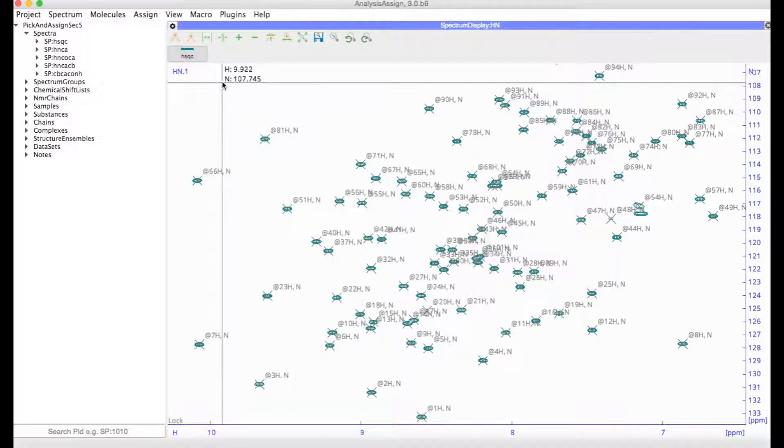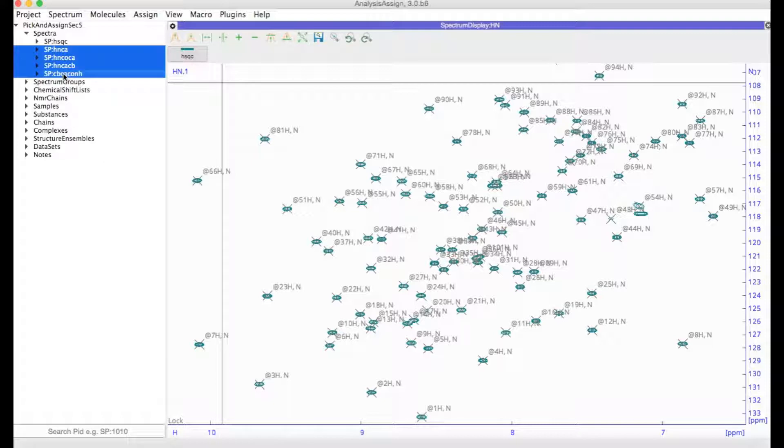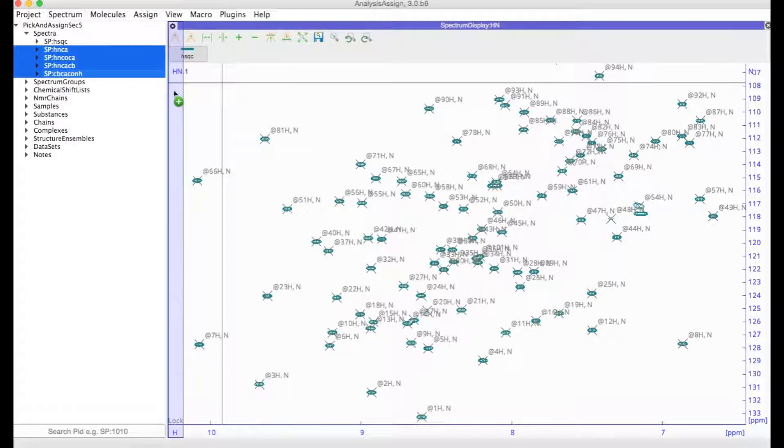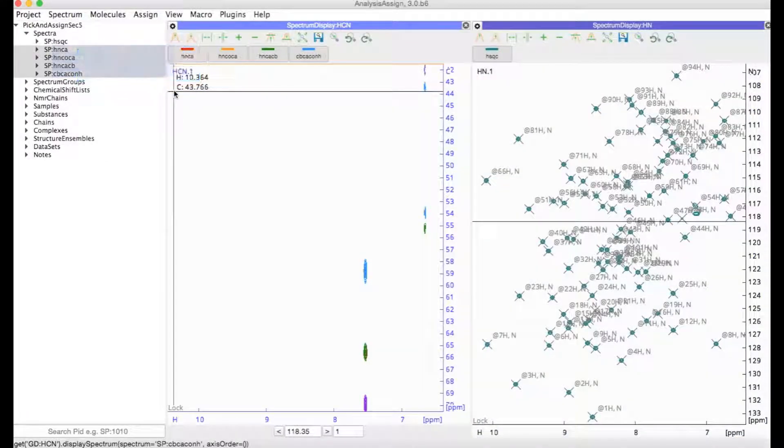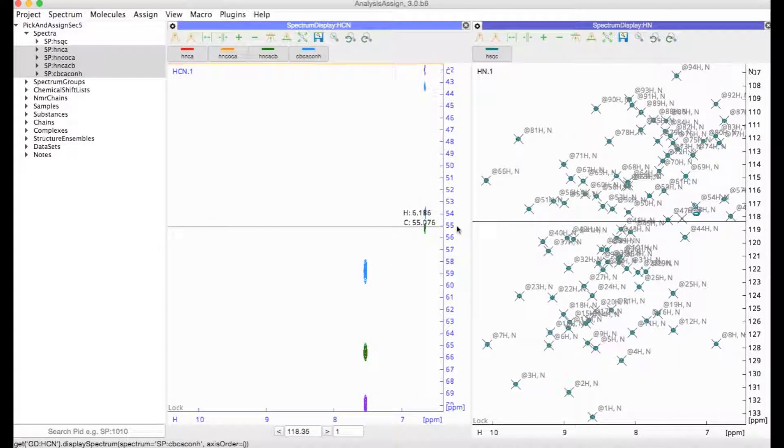Once you've set up your NMR residues, it's time to pick your 3D spectra. I'm going to select my 3D spectra and drag them over here to create a new module for them to be displayed in.